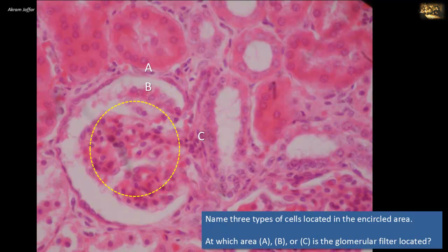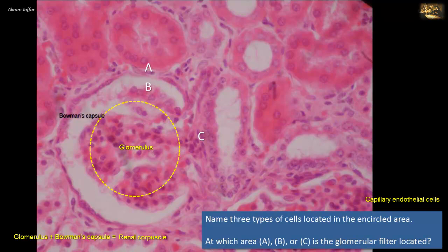The encircled area is the glomerulus, a rounded structure formed of a tuft of capillaries. The glomerulus is surrounded by Bowman's capsule, and together they are called the renal corpuscle. In the glomerulus you would expect to find capillary endothelial cells, mesangial cells of the supporting mesangium, and the third type of cells are the podocytes.